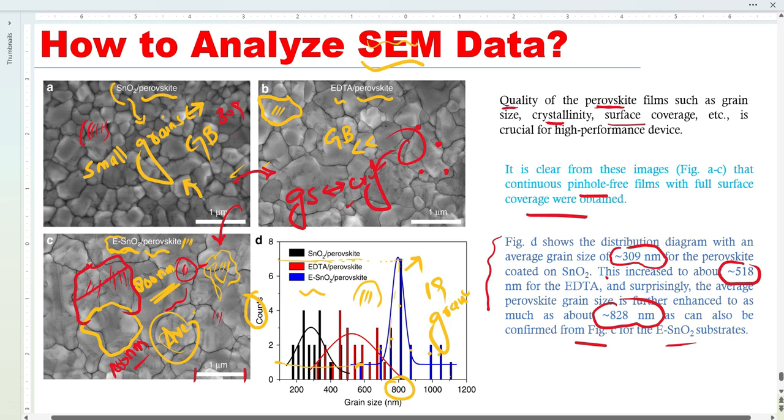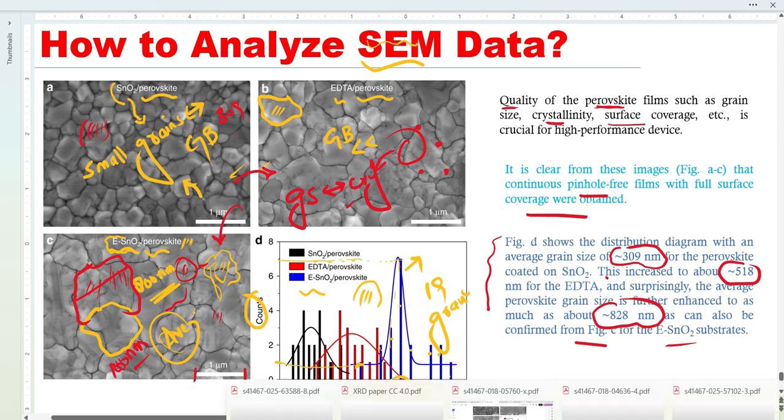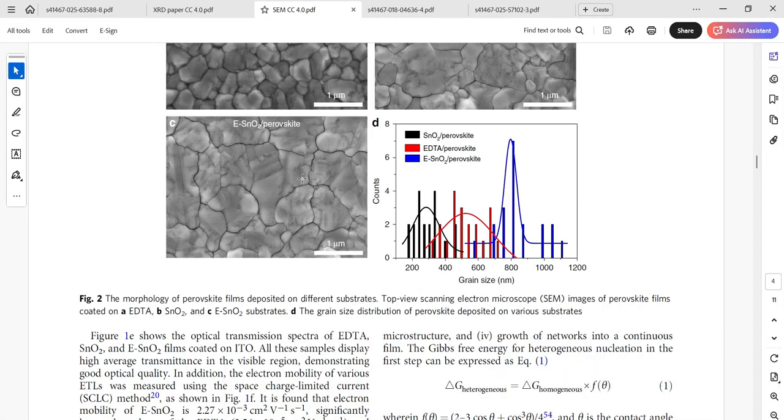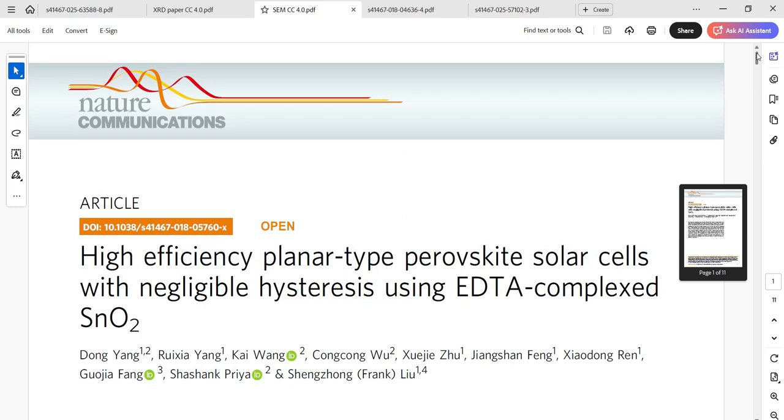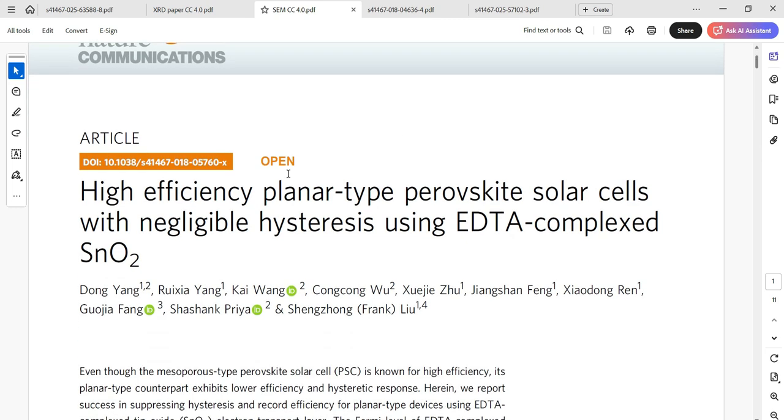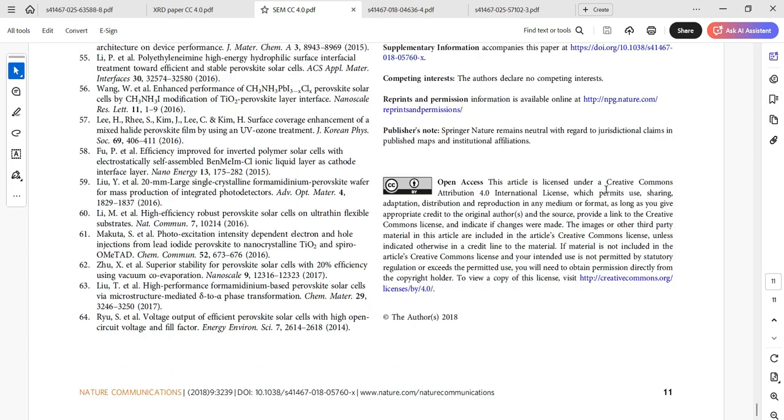So this is how to describe SEM images in a research paper. This interesting data I took from this paper. This is the data I took and it is published in Nature Communications with this title by Dong Yang et al. under the CC 4.0 international license, and the link to that license is given here.